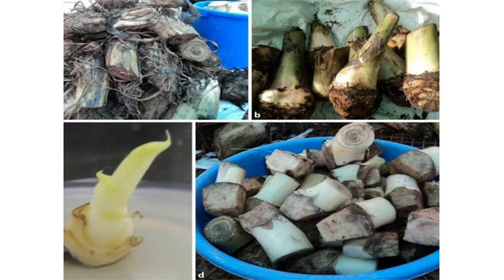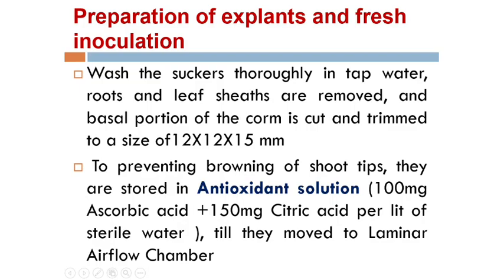Suckers are selected for explant collection. From the suckers, after washing with tap water, the shoot tip is collected. This is the exact shoot tip used as the explant in banana micropropagation. To prevent browning of the shoot tips, they are stored in an anti-oxidant solution — 100 mg of ascorbic acid and 150 mg of citric acid per liter of sterile water — to prevent oxidation until they are moved to the laminar airflow chamber for inoculation.